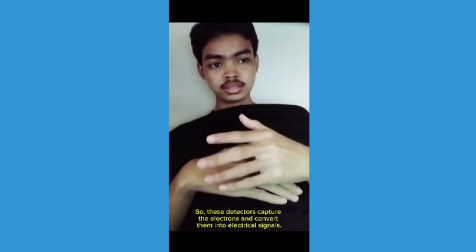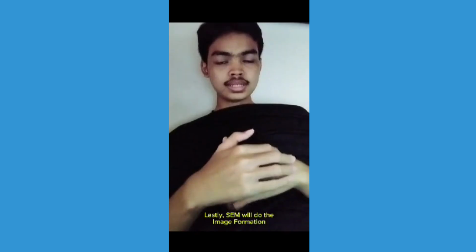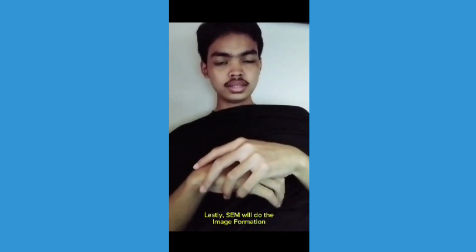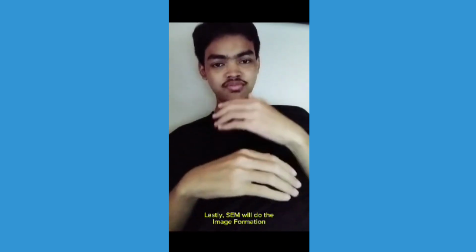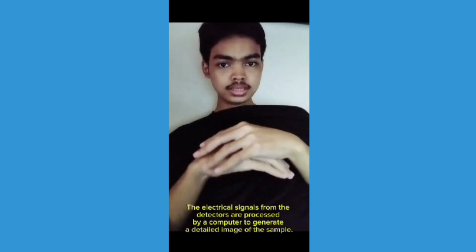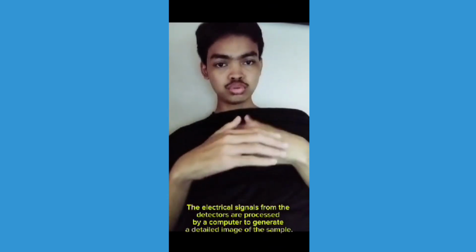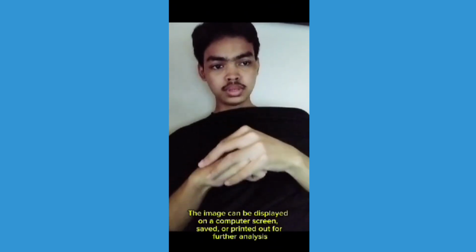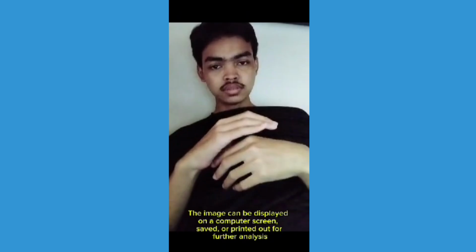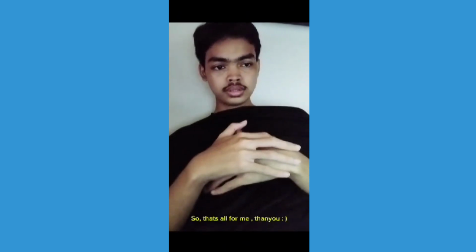These detectors capture the electrons and convert them into electrical signals. Lastly, the scanning electron microscope will do the image formation. The electrical signals from the detectors are processed by a computer to generate a detailed image of the sample. The image can be displayed on a computer screen, saved or printed out for further analysis.